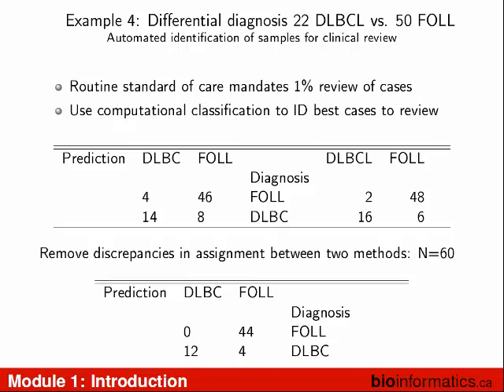And so the hypothesis that we had is we'll use computers to identify those cases that are most interesting for reevaluation. So how do we do that? Well, we train a computer to do what Andy was doing, and then we reanalyze all his data. And if the computer is trained very well, it should get the same answer. If it doesn't get the same answer, that means Andy's gone insane, or it's a problem sample, or who knows, or our algorithm sucks. That'll never happen. But at least it's pulling up problem cases for him that are the most informative.